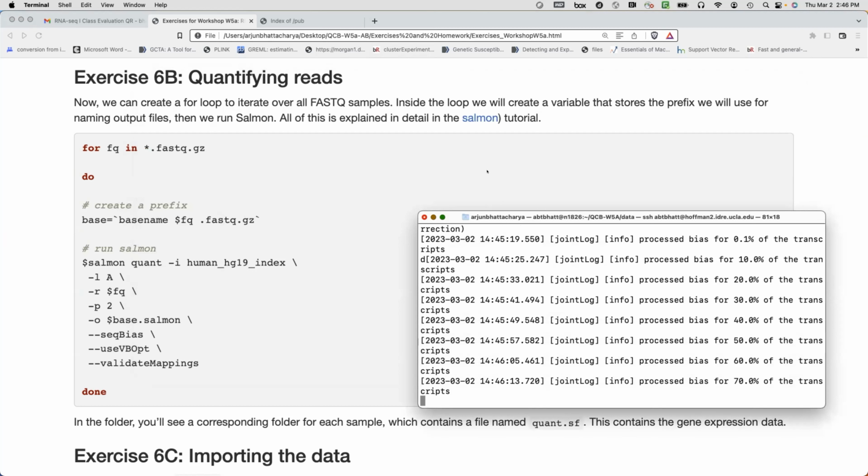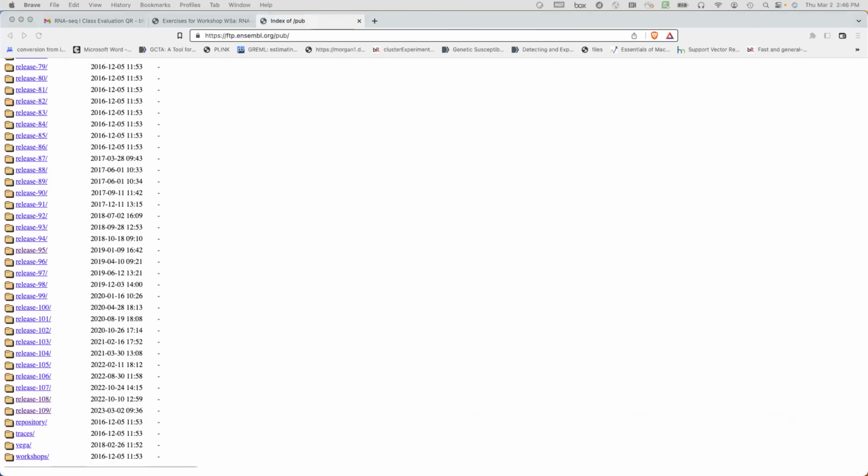Okay. Slowly getting there. Oh, that's not it.